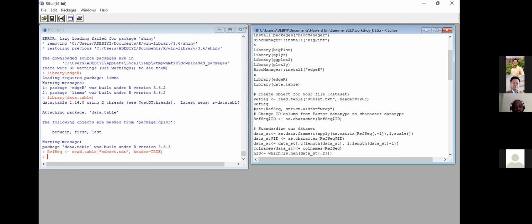question. I fell behind on the scripts. I ran into an error when trying to run the line for installing. How would I go about rectifying it? Let's see. Hmm, we'll fix that in the problems. Okay.